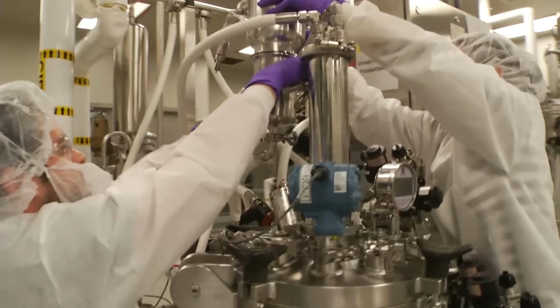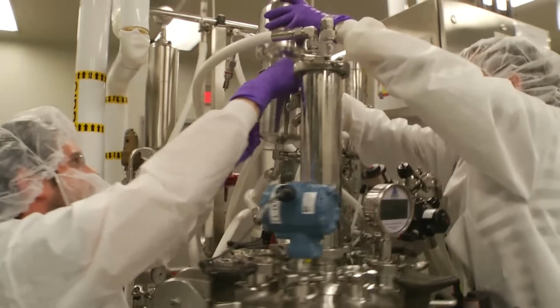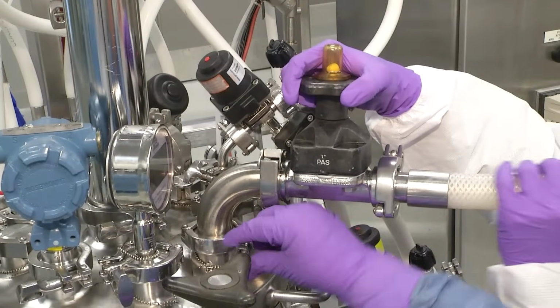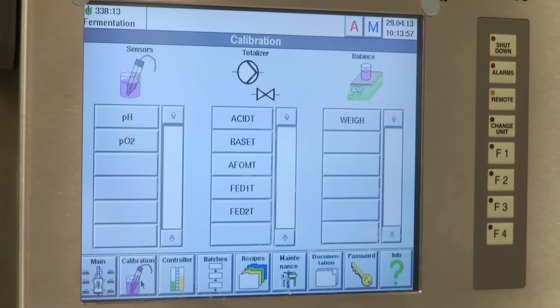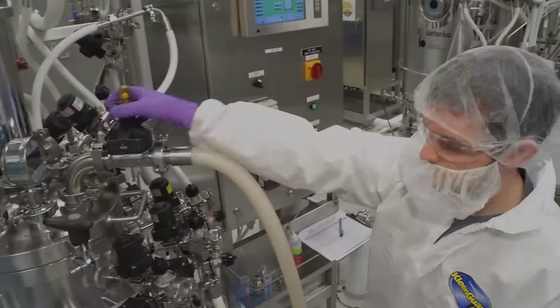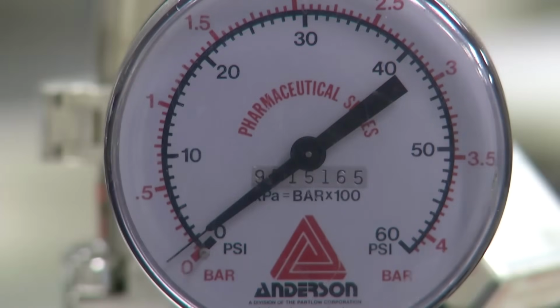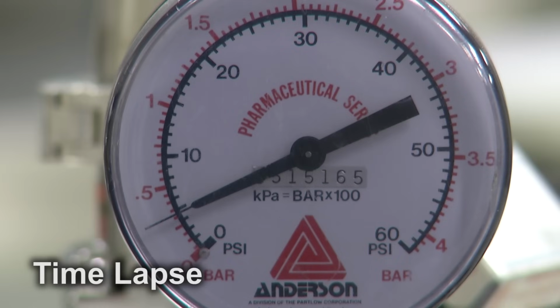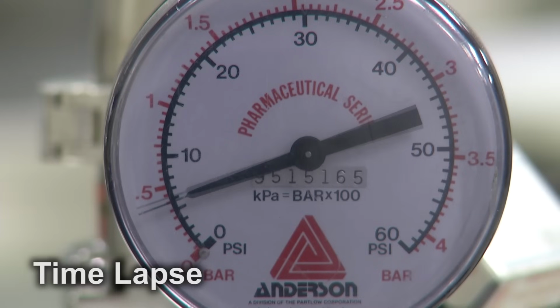Meanwhile, in the fermentation area, operators begin with a complete check of all critical equipment. Valves, caps, and lines are checked. Hoses are tightened. Probes are verified and calibrated. And 10 kilograms of HPW, high purity water, is added to the vessel. The bioreactor is brought up to normal process pressure and held there in order to check for leaks. The pressure is monitored over a 30-minute period. If a leak is detected, the problem is corrected and the test is run again.